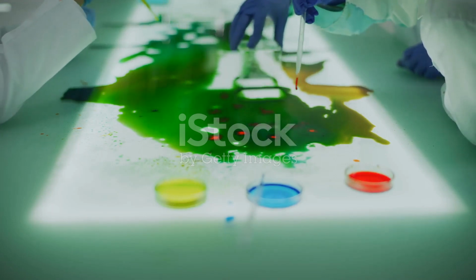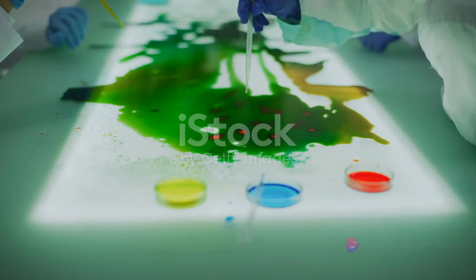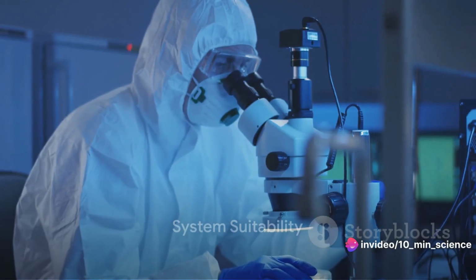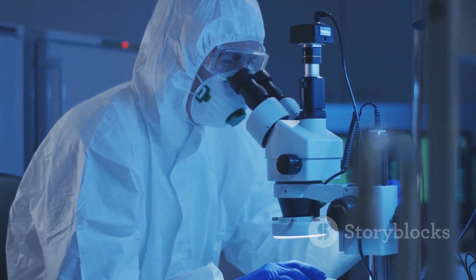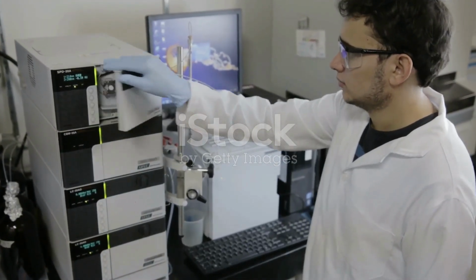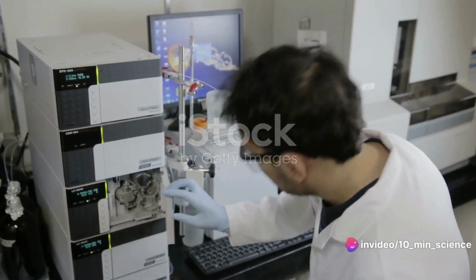Now that we know what USP Chapter 621 is, it's time to delve deeper into its sections. The first section of USP Chapter 621 introduces us to system suitability. Now, what is system suitability, you ask? Let's dive into it. System suitability, in the realm of chromatography, is a series of tests to ensure that the system is apt and ready for the analysis.